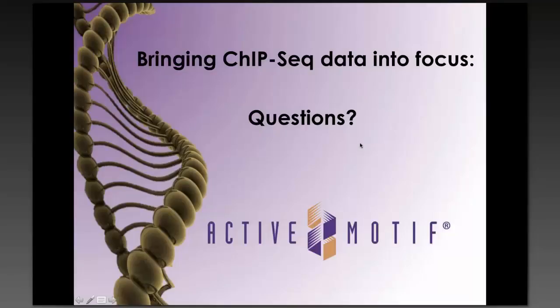And then secondly, I guess the question is, does that bias you in any way when you're trying to look at differential binding, and differential meaning on-off binding at select genomic locations that may be occurring within this global regulation?